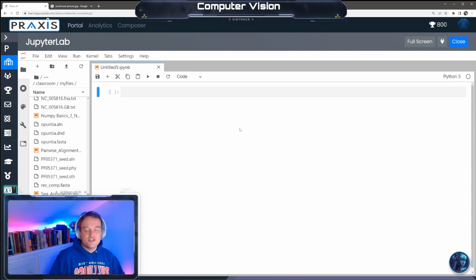Computer vision is a way to process images with Python to ideally write a script to do these measurements for you, and then just loop through it and get all those things measured and put into a spreadsheet, and then you don't spend 6 months or whatever I spent measuring these things, right? So that's the whole point behind computer vision.